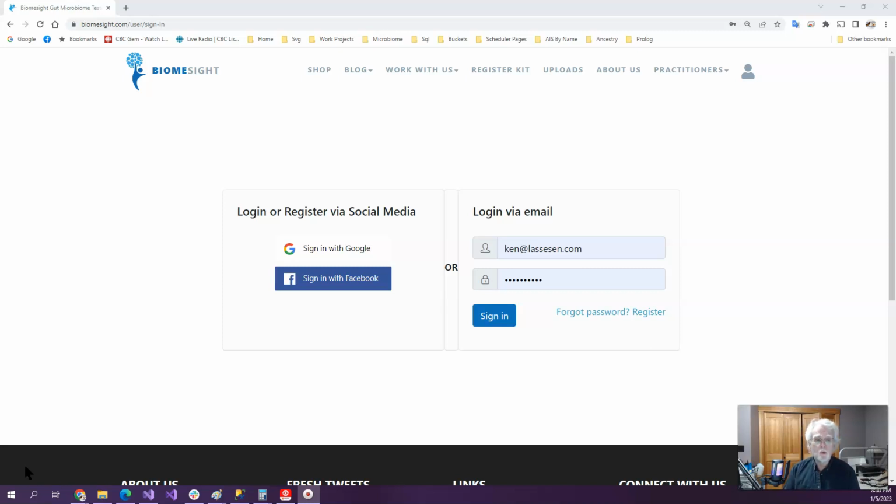The second thing I'm going to do is show how to upload a sample from, for example, Ombre Labs or some of the other ones, the same pattern, and how to do that. Then we'll look at walking into it and what you should look at the very first time in there, and do an introduction to the website walkthrough and give you an orientation to the website.